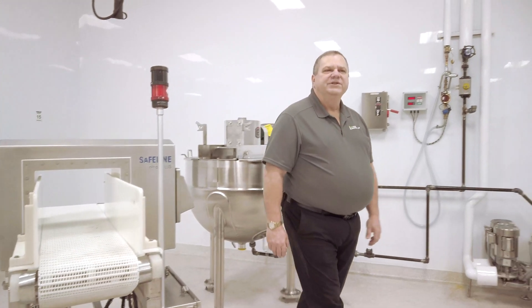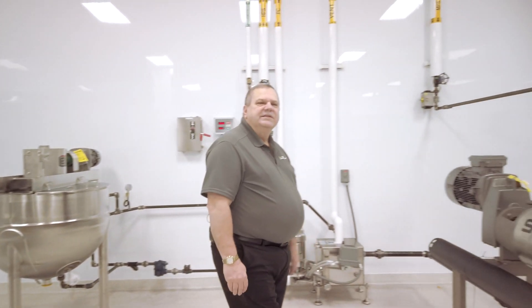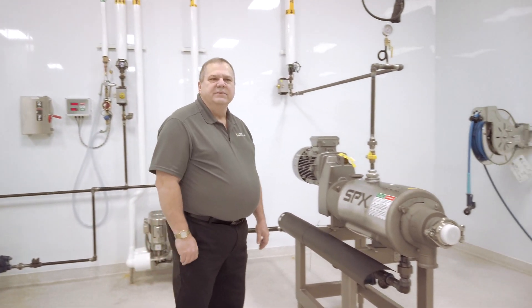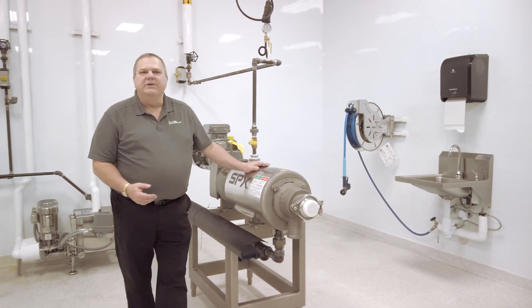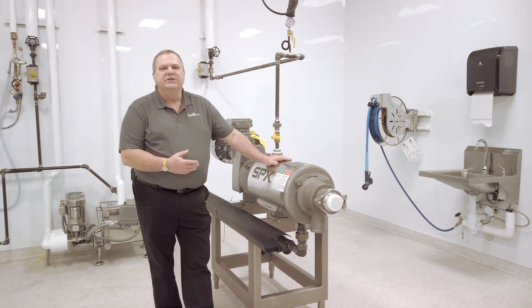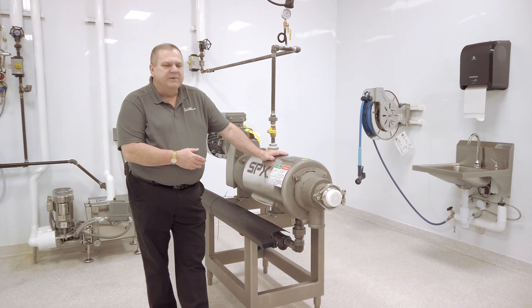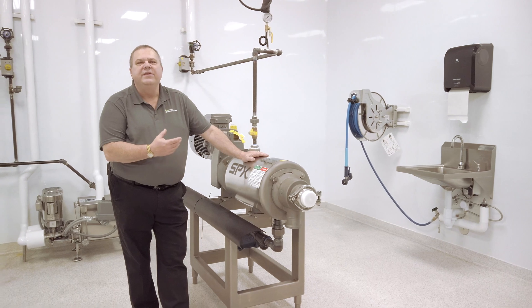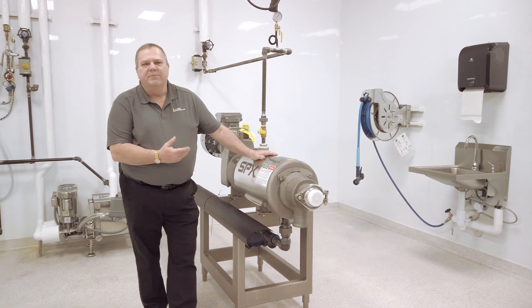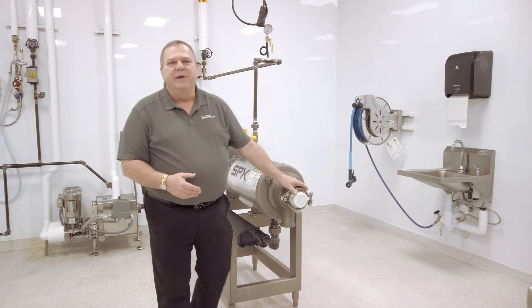We're in the thermalization and packaging area, where the last step most foods see before they're ready to be eaten by consumers takes place. The first piece of equipment I want to talk about is our swept surface heat exchanger. This piece of equipment is used to sterilize things like nut butters, hummus, and anything thicker in nature. When products come out of here, they are literally ready to eat.